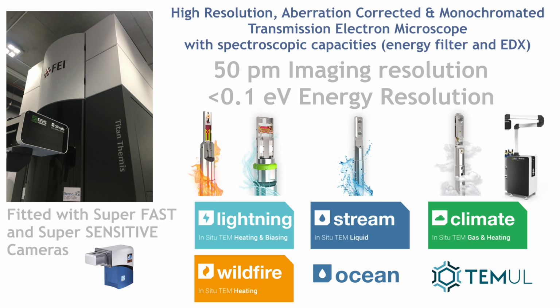On the left-hand side, you see the Titan Themis cube. So the actual TEM is encased in a 4-meter high cube to protect it from environmental influences like temperature fluctuations, vibrations, and magnetic fields. Because we want to see things on the atomic scale, we need to have everything dead stable.